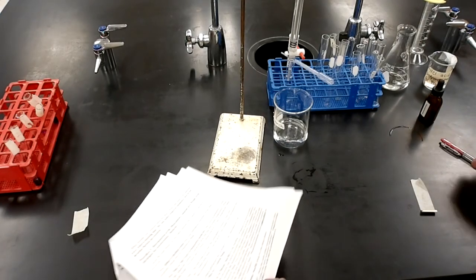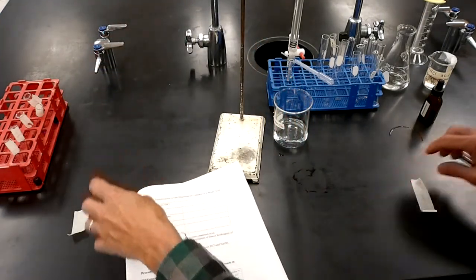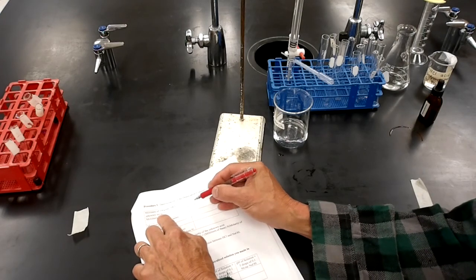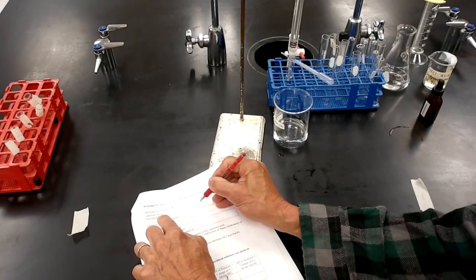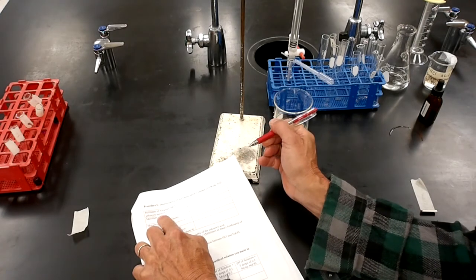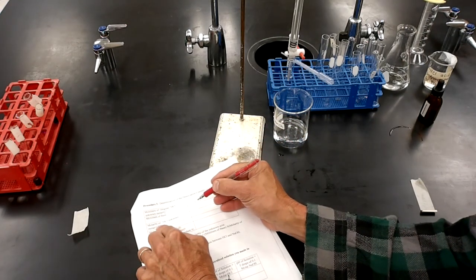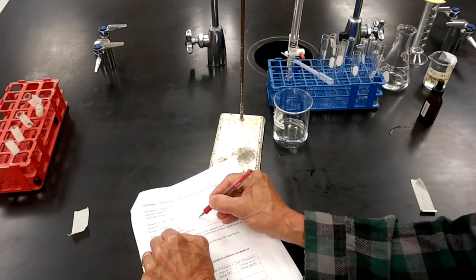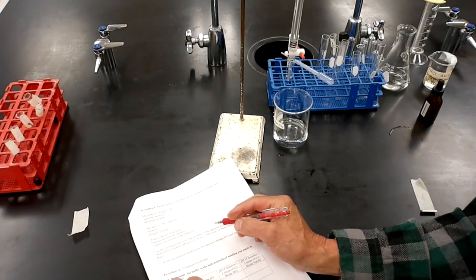All right, get back to my data sheet. This is a data sheet I'll be posting. So milliliters of original hydrochloric acid. The unknown acid, there's actually 12.5 milliliters of that unknown original acid in this beaker. Milliliters of base, I don't know. Molarity of the unknown acid, I don't know. Molarity of base, that's a given in the instructions. It's 0.2 molar. It's also written on the burette.